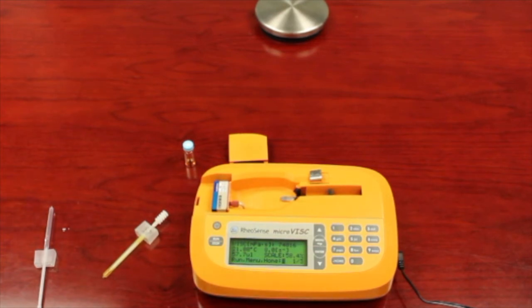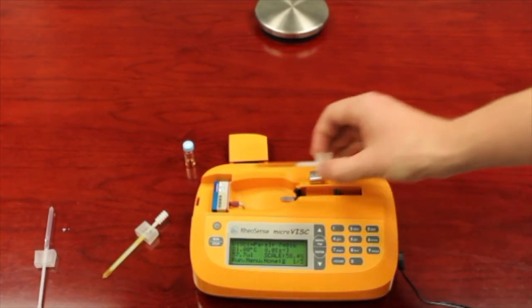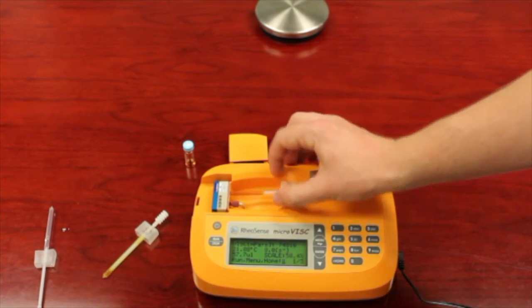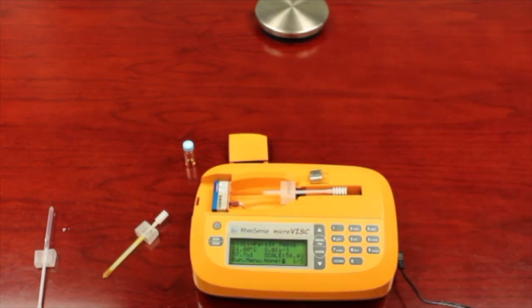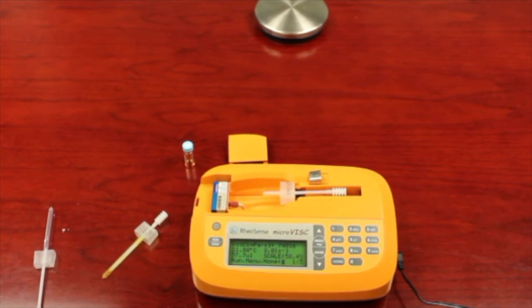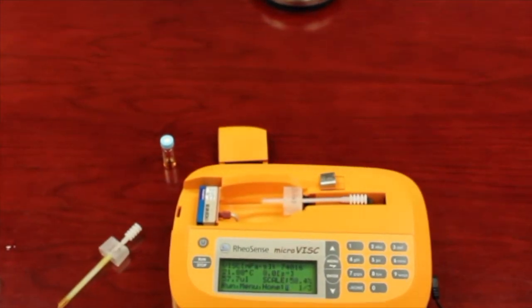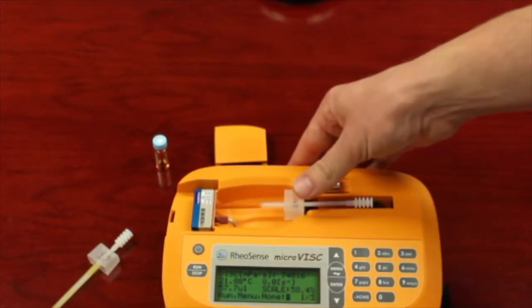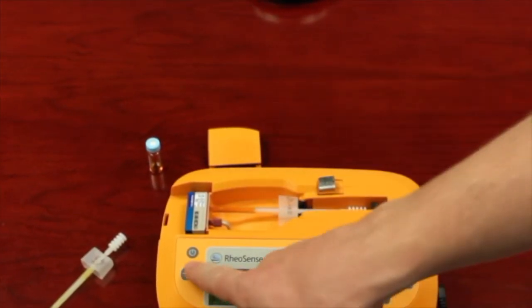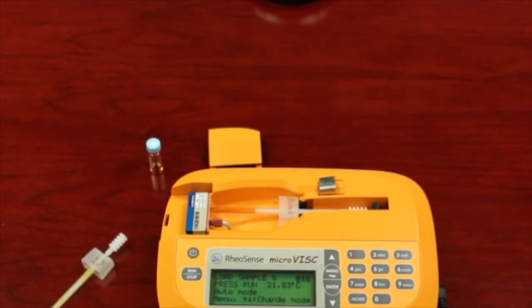And so terpenes tend to be much lower in viscosity than the raw material. And so it's critical to know and understand the viscosity of your beginning samples so that you can really dial in that formulation. This takes the guesswork out of how you make your products.